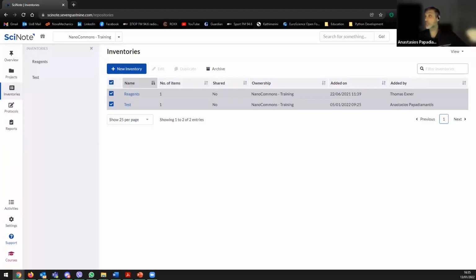When new people come in, we tell them this is the protocol that we follow, for example the NanoChain protocol for sample preparation. I'm sorry, I'm blacked out. So the protocols within the protocols inventory repository will be accessible to everyone within the team.